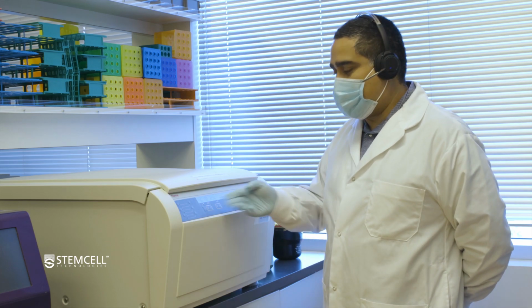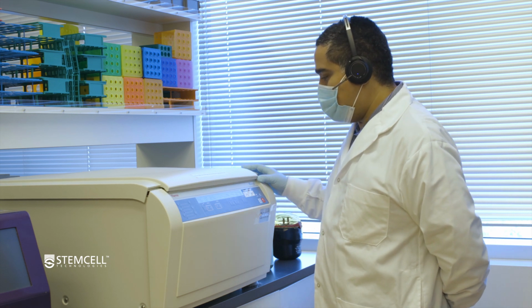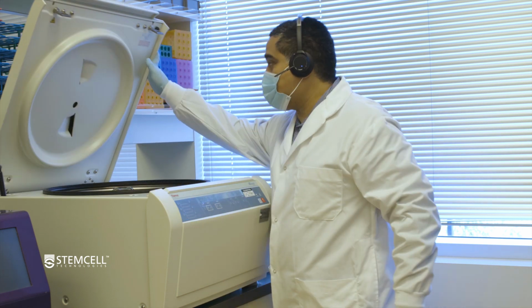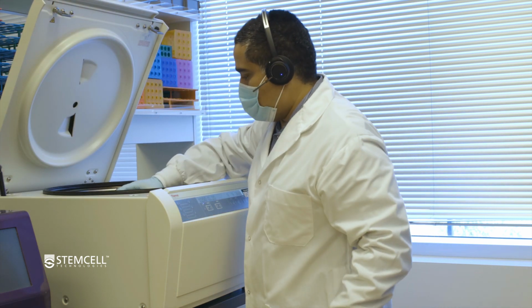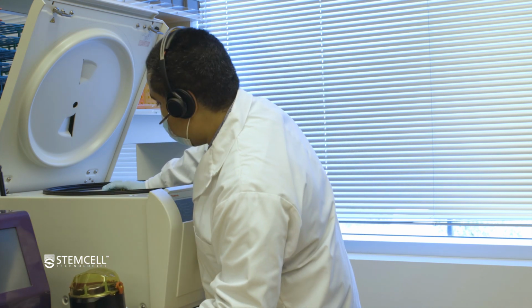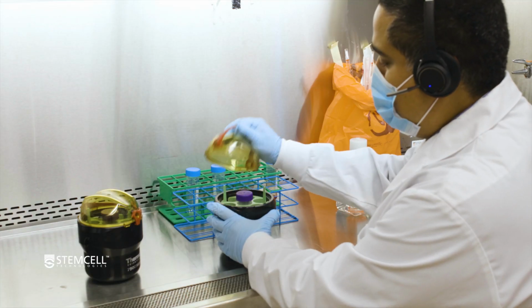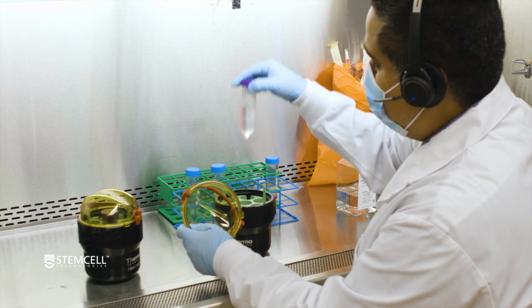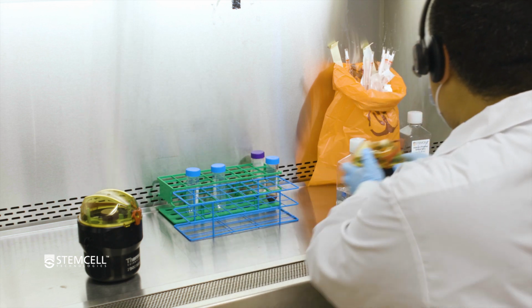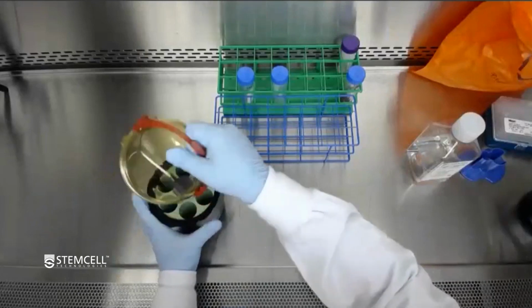Okay, so here it's been 20 minutes and the run has finished. So we're just gonna open this up. And normally best practice is to open these in the biosafety cabinet. So that's what we're gonna do. So here, I'm just gonna open this up and I'm pretty sure this is just the balance that we were using. So we'll set that aside. And here we have our actual SepMate spin.